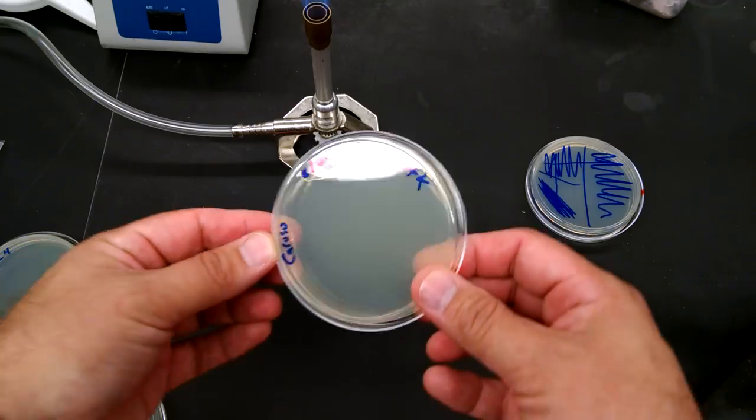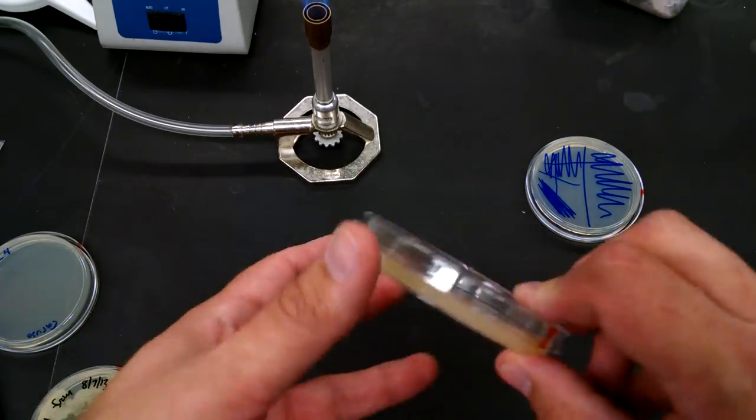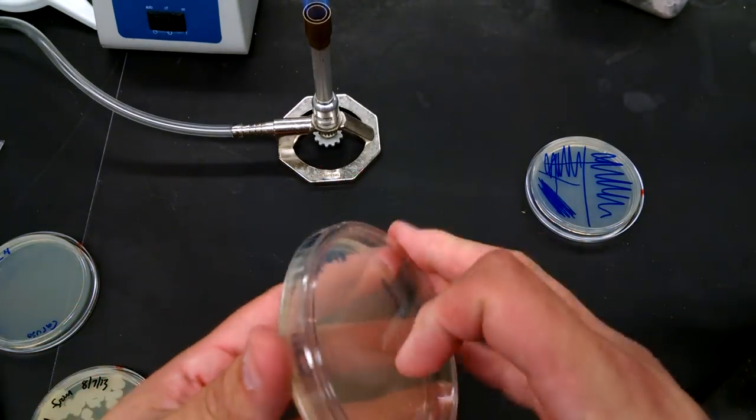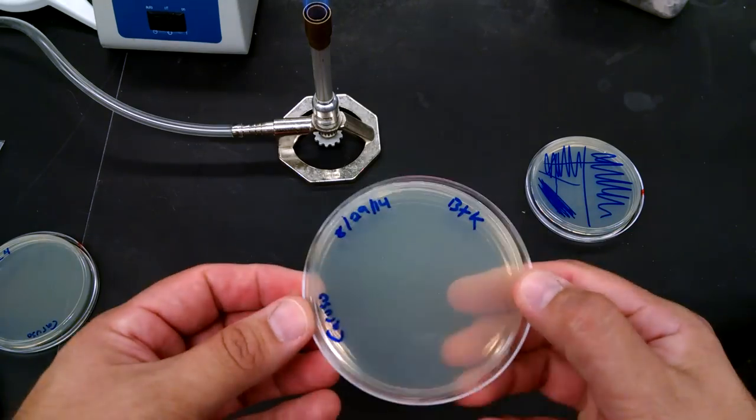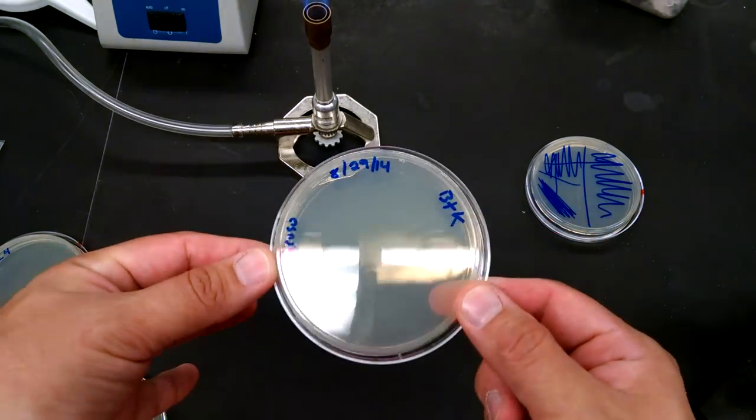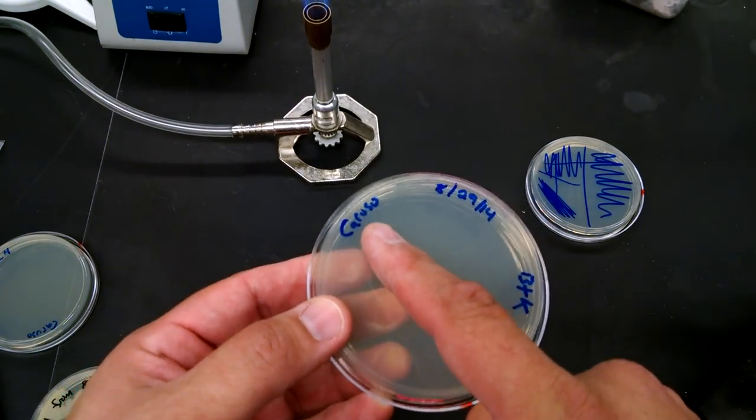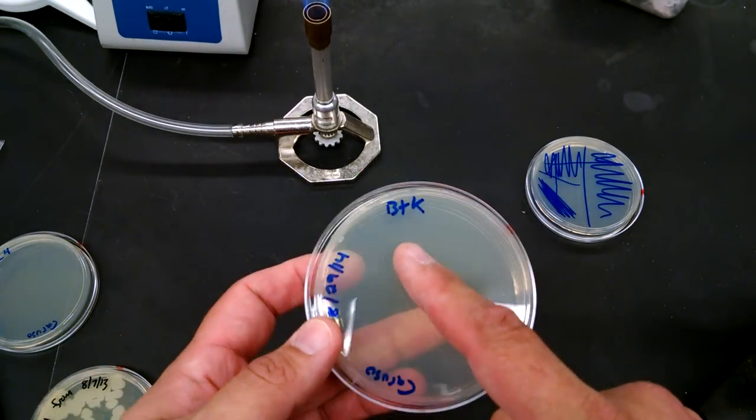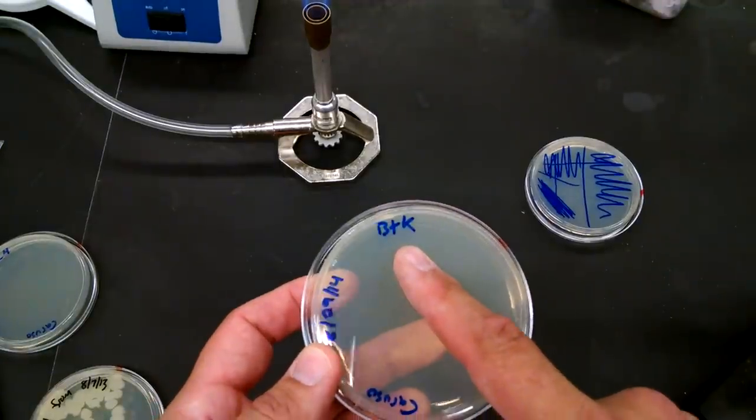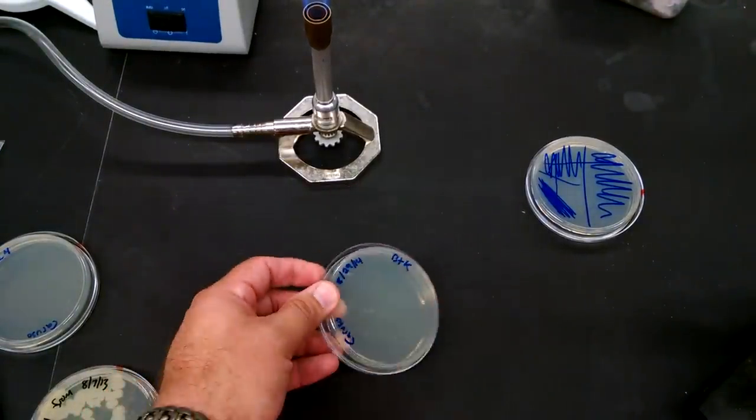So we have a plate here. It's already labeled. Remember, you want to label your plates. You want to label them not on the top because lids come off, right? Label them on the bottom because that's also how we store them. We store them upside down. So we've got it. I've got my name on it, I've got the date, and what I'm putting on it. It's going to have BTK, the bacteria that we use in the Phage Hunters lab.